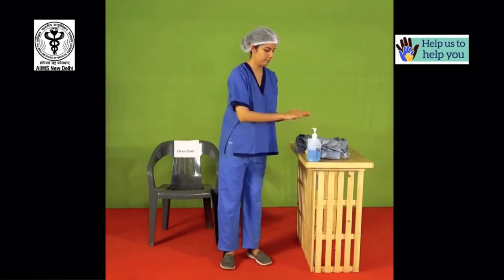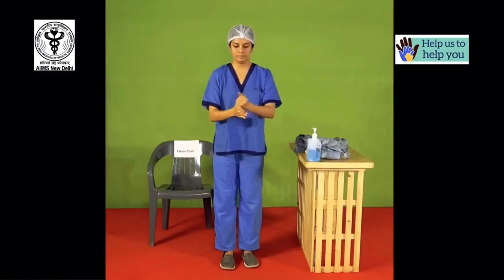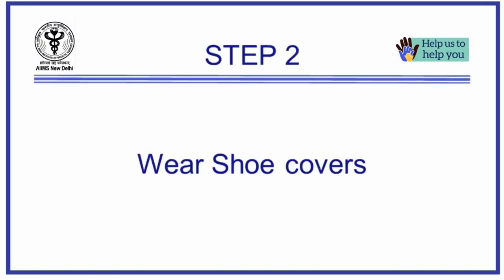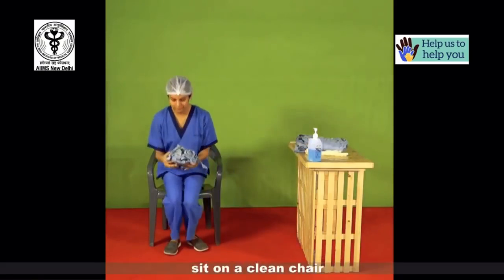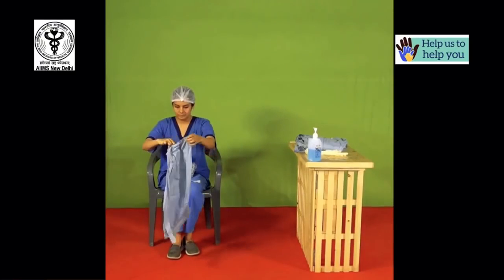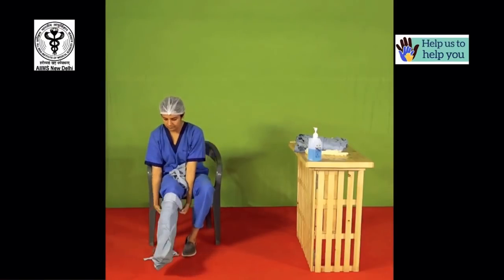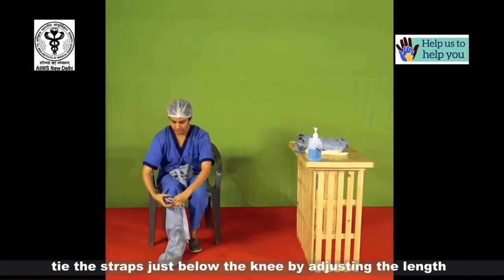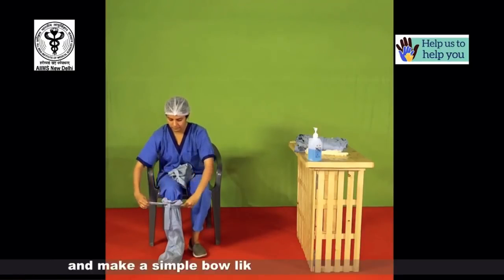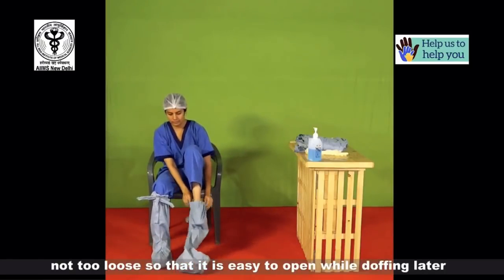Now perform hand hygiene. Sit on a clean chair. Tie the straps just below the knee by adjusting the length according to your height and make a simple bow-like knot which is not too tight, not too loose, so that it is easy to open while doffing later.